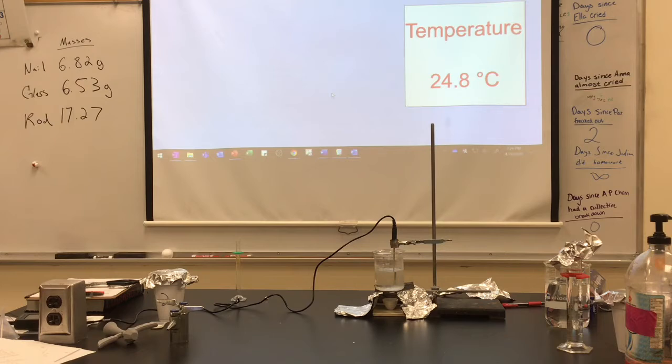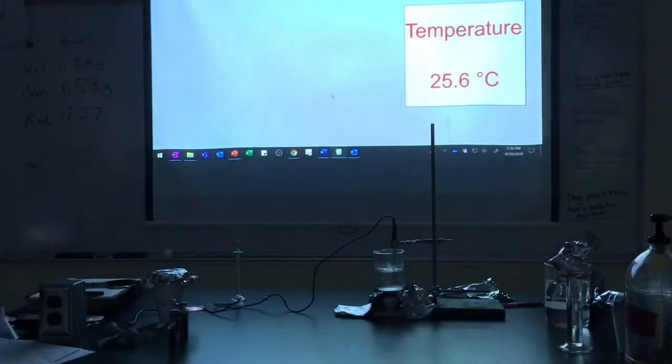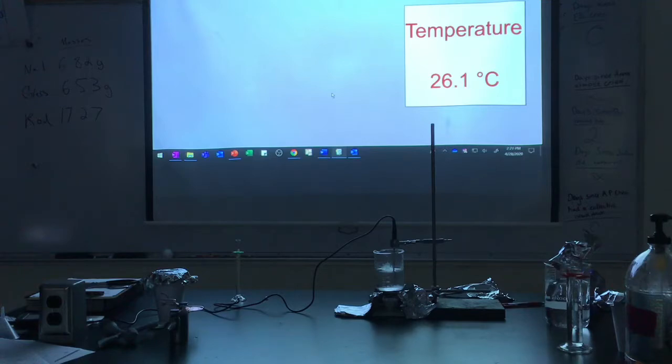So you can't really see the flame under there, class. I'm going to turn the lights off so that you can see the flame a little bit more clearly. Hopefully this shows up on the video here that you can see there's a small amount of blue flame burning under there. And you can also see the temperature is going up as we burn this methanol down in that can. Okay, the tin foil on the outside is supposed to funnel all of the heat into the bottom of the beaker. Okay, so let's see how hot we can get this as we burn this methanol.